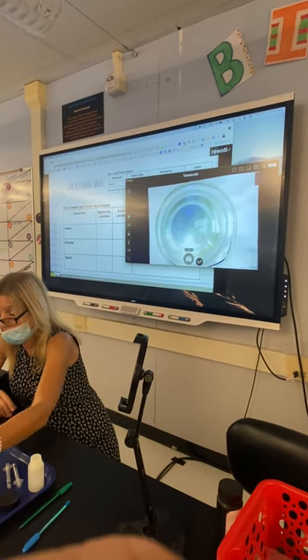Is there starch in the bag? You know, because it turned blue. Is there starch out here in the beaker? How do you know that? It's not blue. If starch could get out of this bag, starch wants to go from a higher concentration to a lower concentration. If starch could get out, it'd be out here in the solution — and then what color would the beaker be? Blue. So we know starch beginning location was in the bag and its ending location is also in the bag.